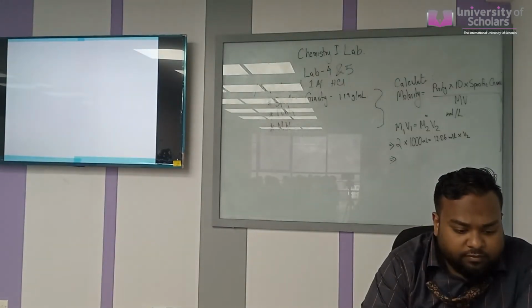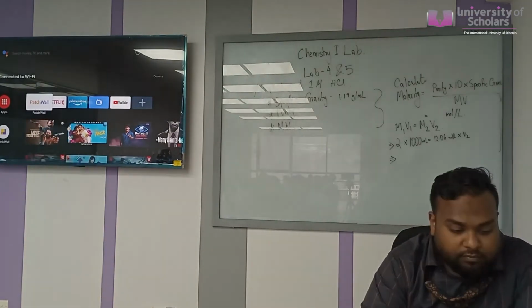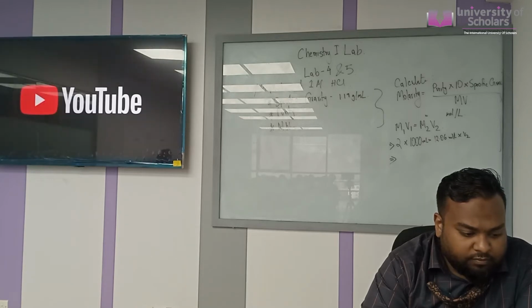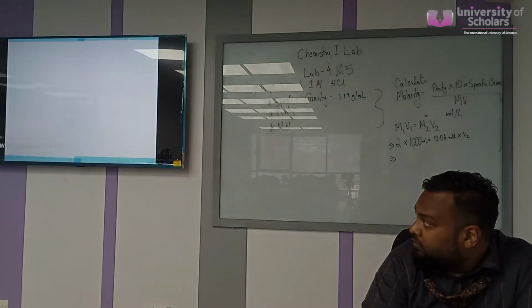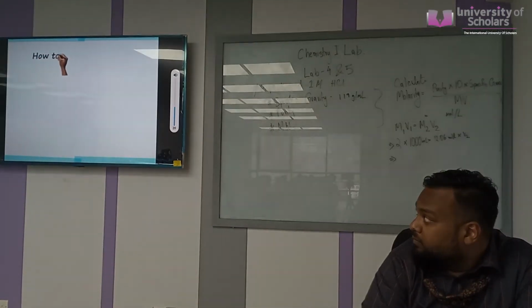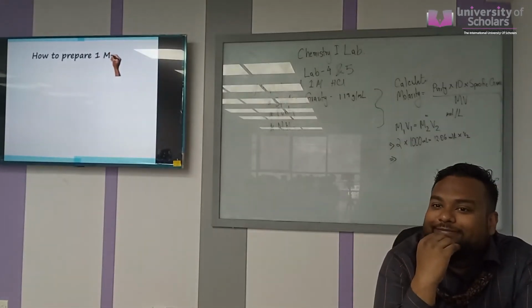Hi, this video will explain how to prepare 1 mole per liter hydrochloric acid. Using the same method, you can prepare other acids or bases as well.